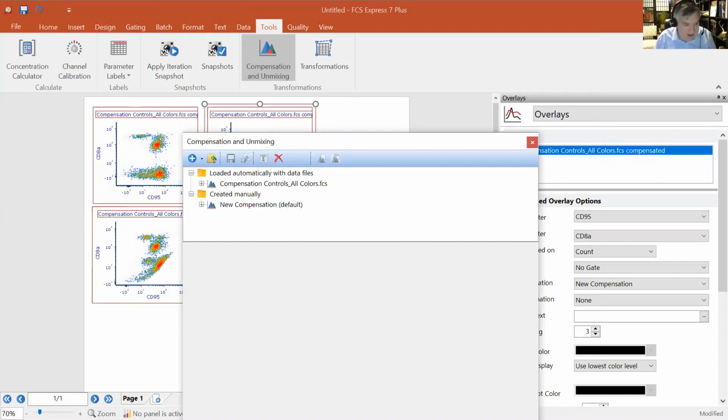I do just want to pause for a second. Kathy, were there any questions that came through before we move forward to unmixing? No, there weren't any questions that popped through. I think everything was pretty clear with compensation.